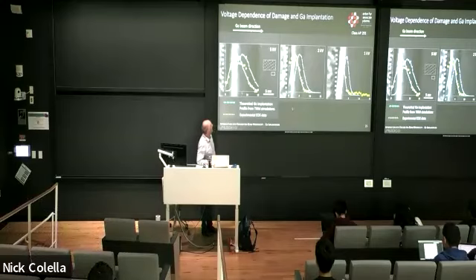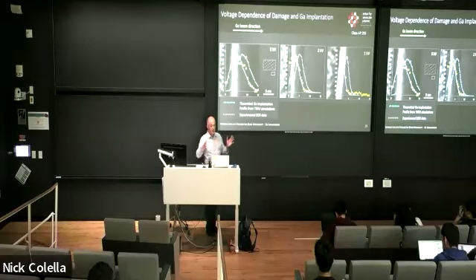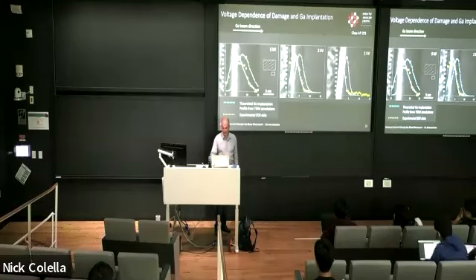So we can see the crystalline structure on the right side of the image, and then the defect zone and the gallium implantation on the left. And you can see how, with the reducing energy of the gallium ions, the defect zone gets smaller. Yeah, because the gallium ions introduce less energy and they are stopped with fewer scattering events.